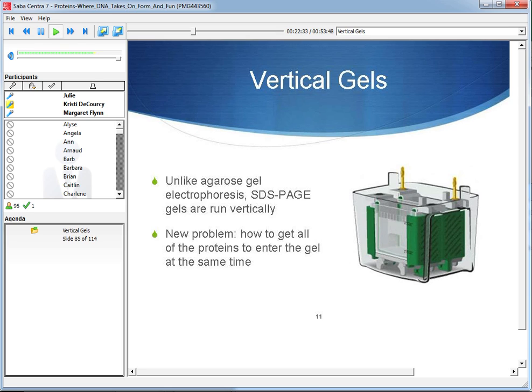And this is just a gel box. This picture here is a gel box with the lid off. You can see right where I've got the star that that's where the wells are. And behind that, in this space, is the upper buffer chamber, which contains the negative electrode. The gel is running down between two plates to here, and down at the bottom here is the other electrode, the positive electrode. So the only connection between this chamber and this chamber, which contain the two electrodes, is the gel itself.